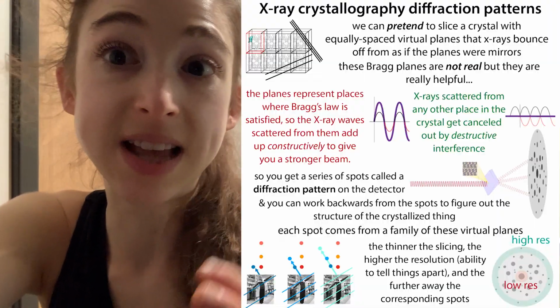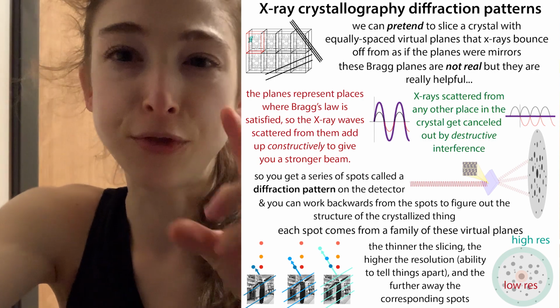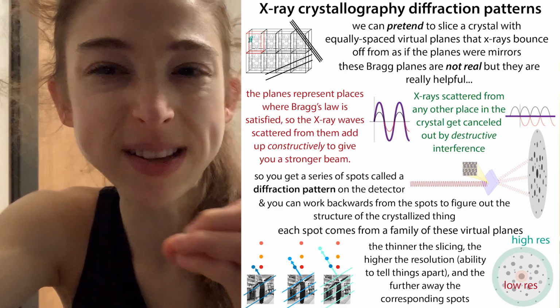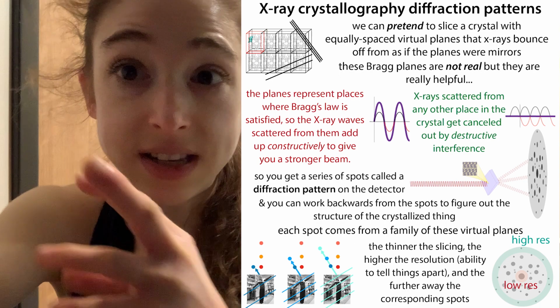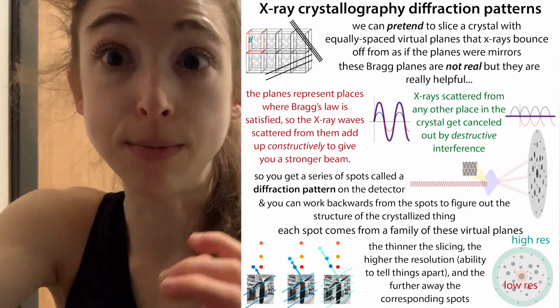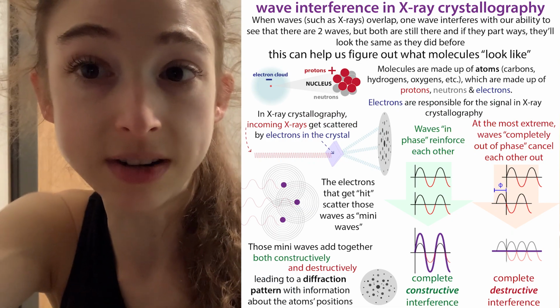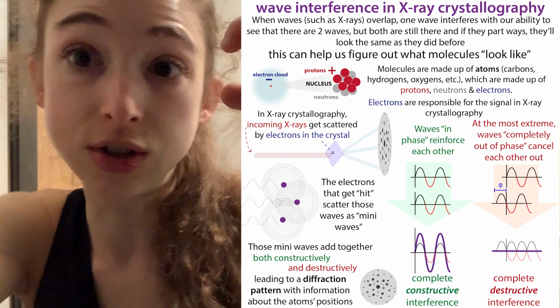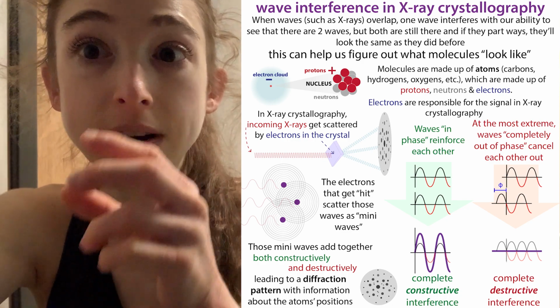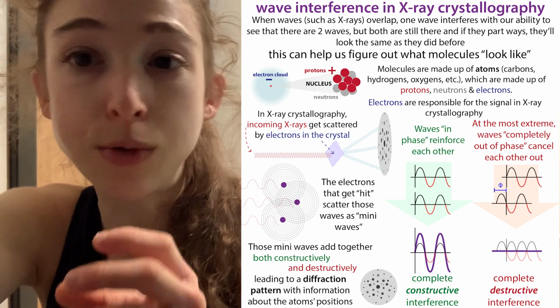And then what happens is that the signal from the X-rays, when you beam those X-rays at it, they're going to get diffracted by the atoms in those molecules. And we'll talk more about what this means, but basically they scatter. And then those scattered X-rays are going to interact with one another. And when they interact with one another, they can either build up constructive interference or cancel each other out, which you call destructive interference. It's kind of like if you were to drop two golf balls into the water, and then you see the ripples, and there's places where the ripples look bigger, and then there's places where there's anti-ripples. I don't know, what do you call it? But anyway, the waves are going to add together.